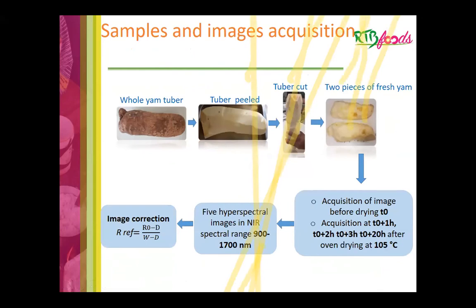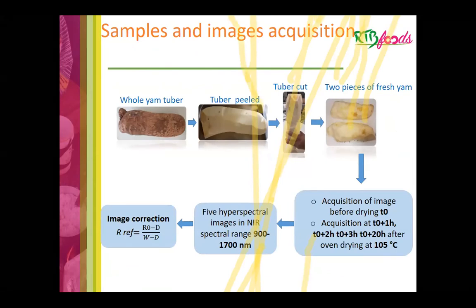I decided to peel because I don't need the information from the peel. That is why I peel the samples. Yeah, but it would not be necessary when you go later for starch and for protein or whatever you showed there. I would skip this step. Yeah, don't peel it. You can skip this step. Okay, thank you.